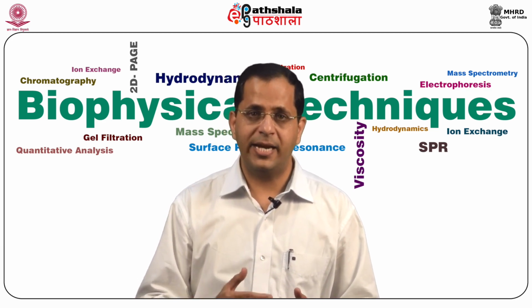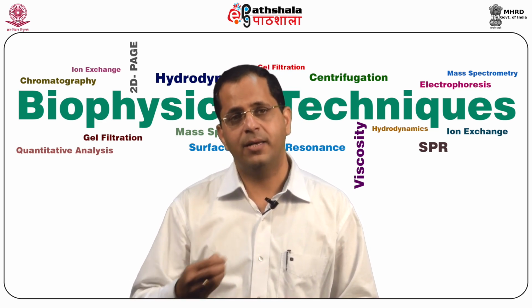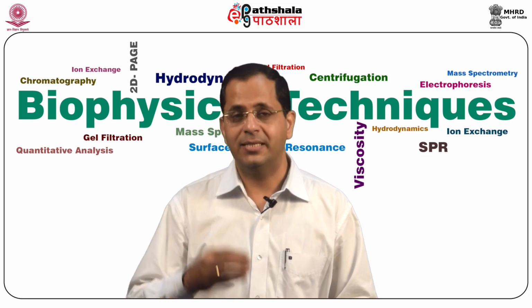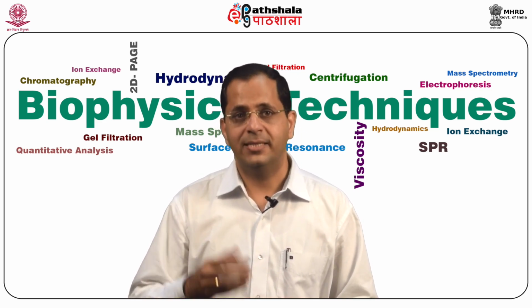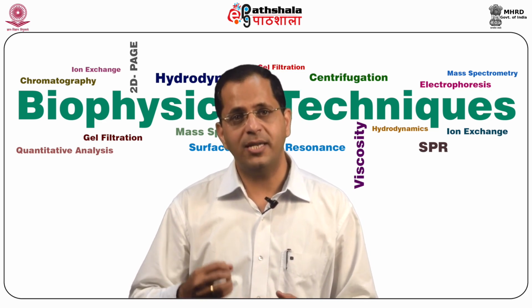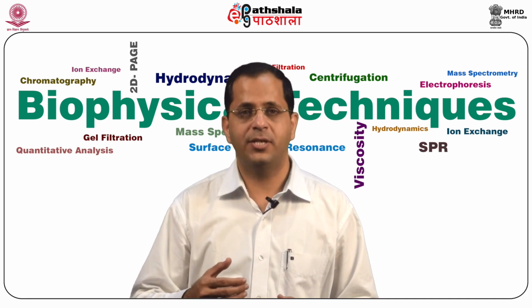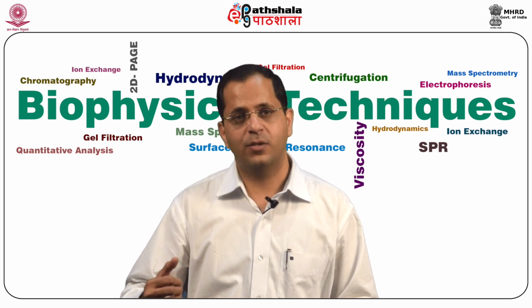Saturation labeling is designed to be used for applications where only small amounts of sample are available. The dyes here saturate the cysteine residues. The dyes are mass and charge matched, but there is a smaller chance of protein modification and isoelectric point shift on the isoelectric focusing technique.